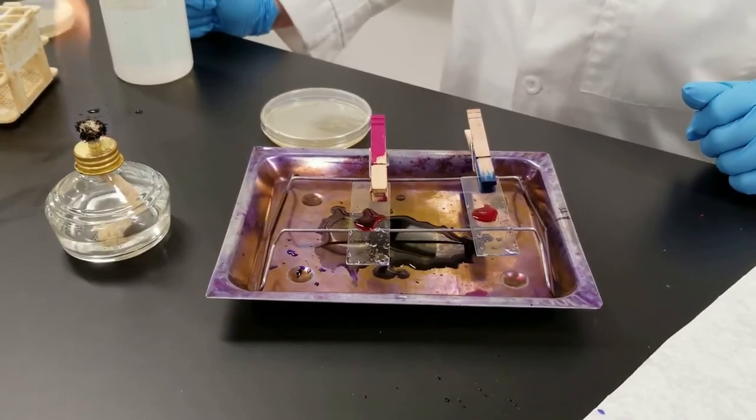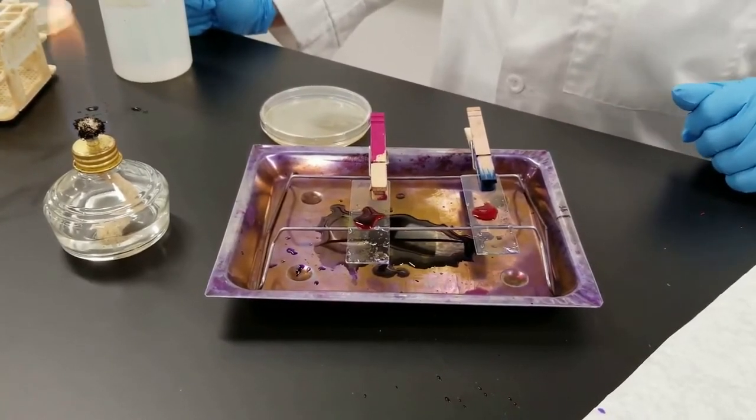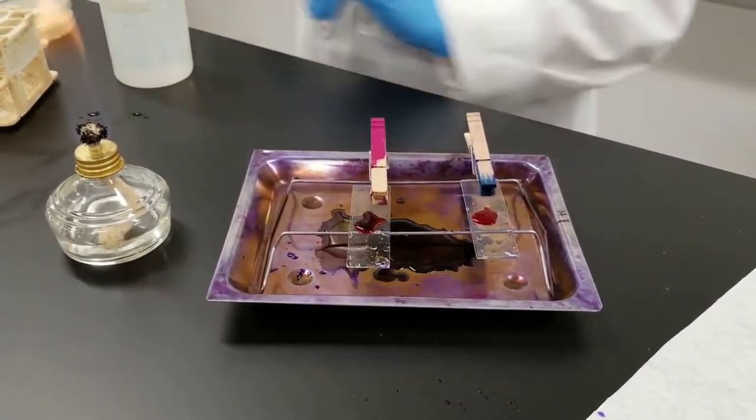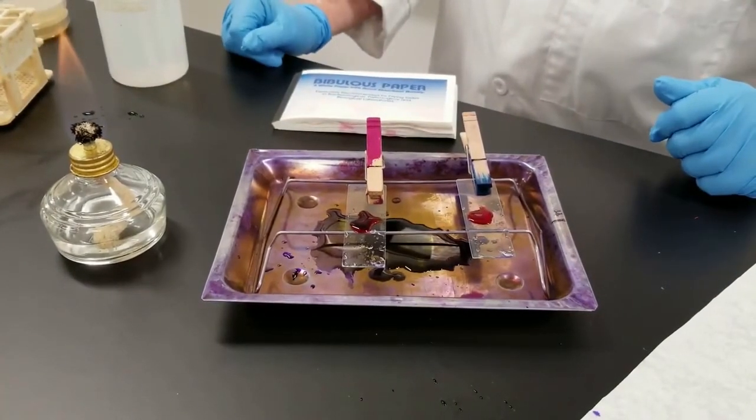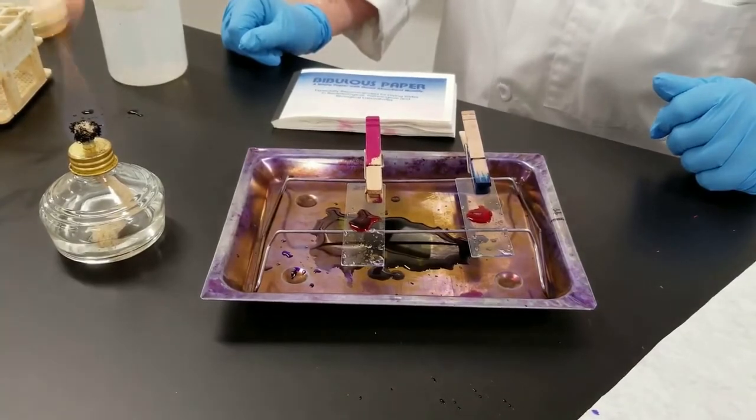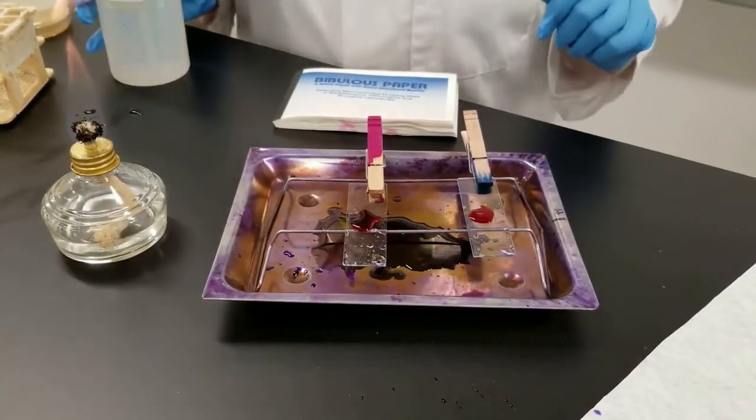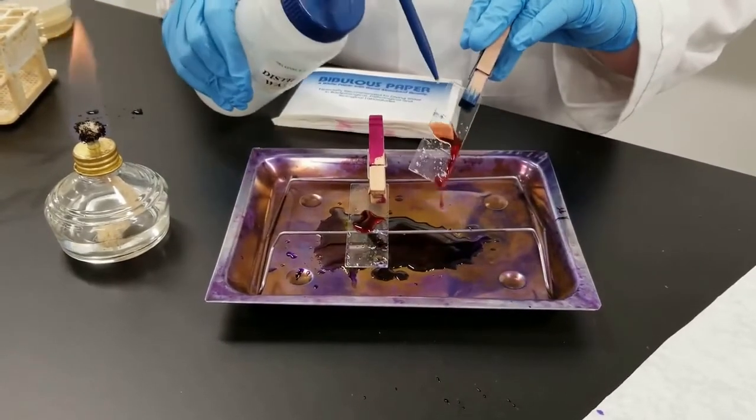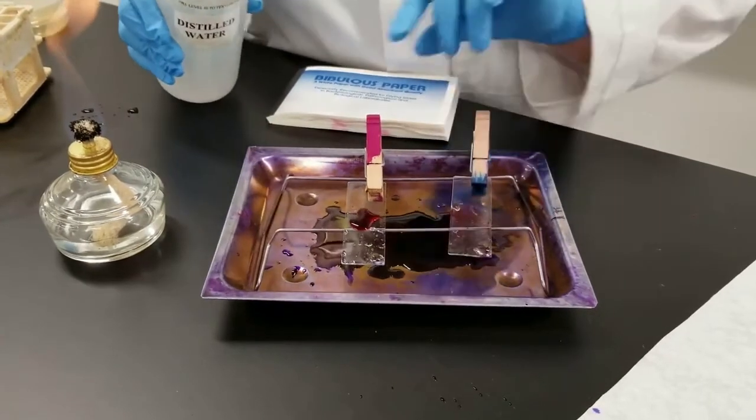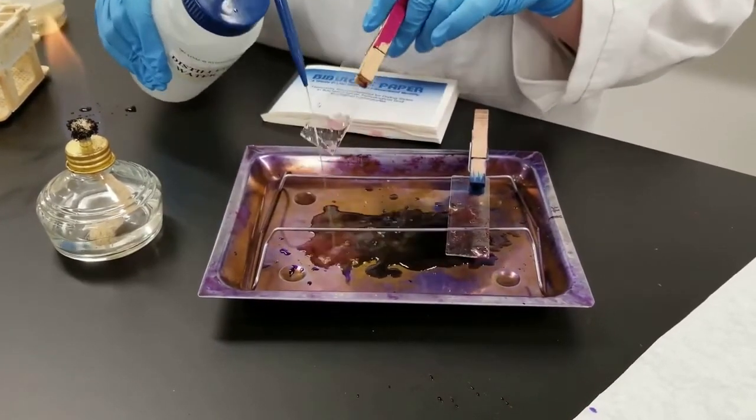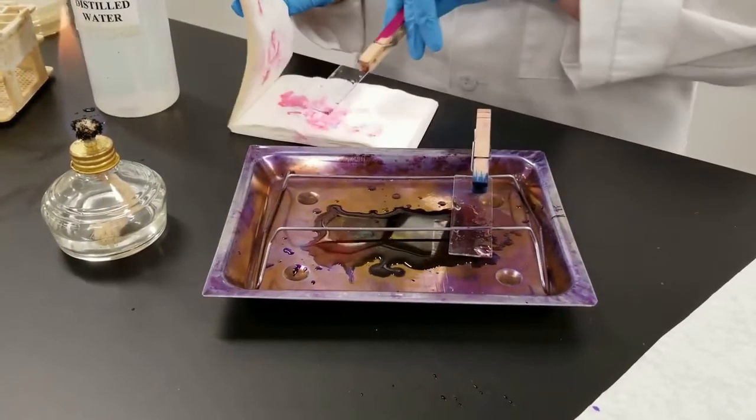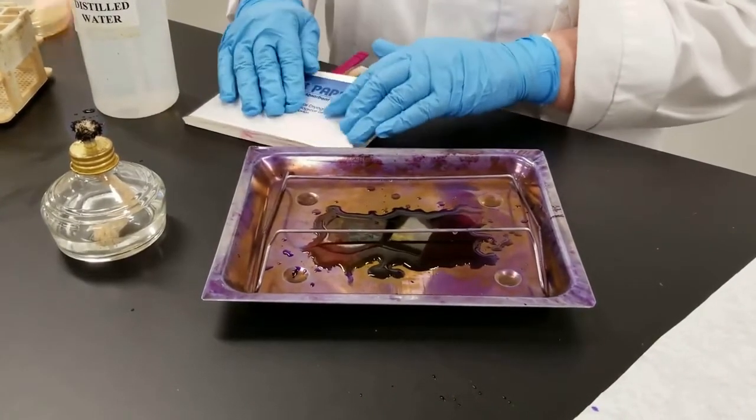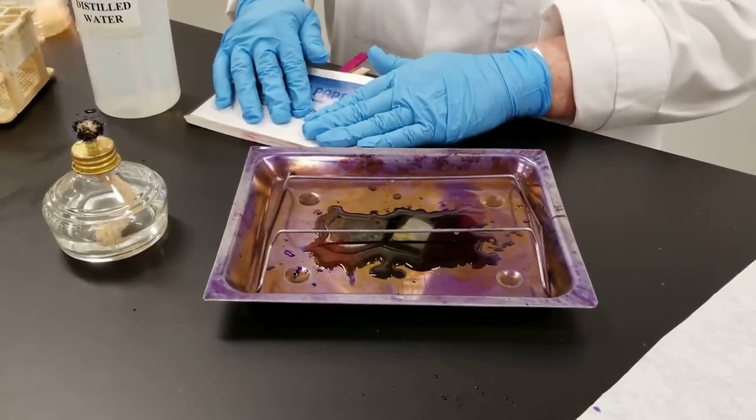When we are done with the safranin red, we will rinse it off, and then we will blot the slides in the bibulous paper as we've done with simple stains, spore stains, etc. So now we will rinse off this final step, and we will just blot them in the bibulous paper. Just be gentle as you do that. Let them dry for viewing later.